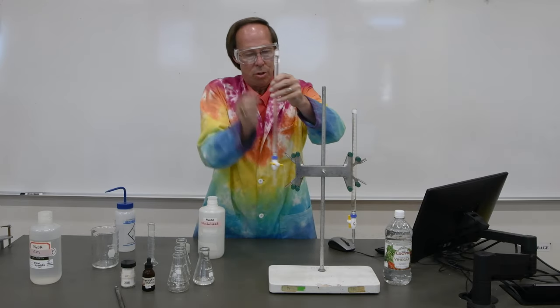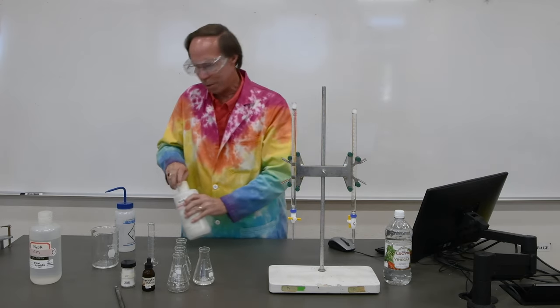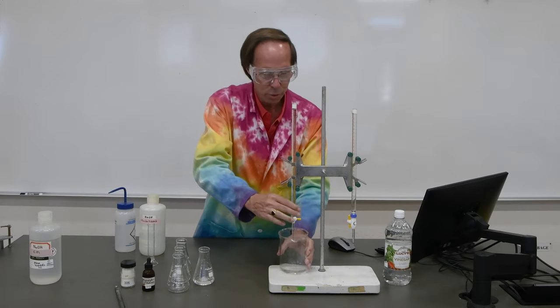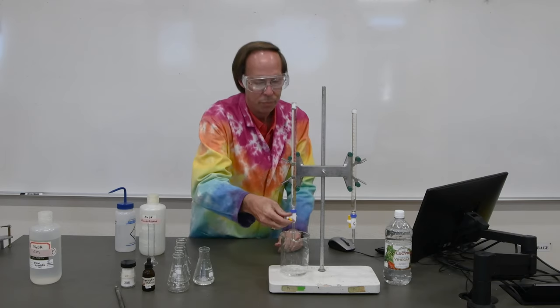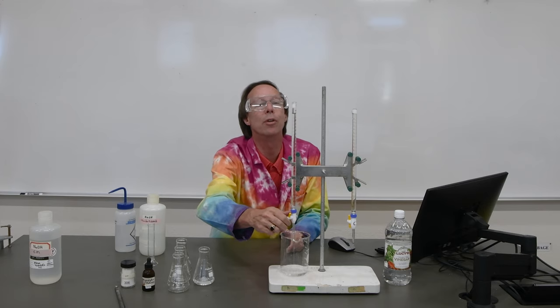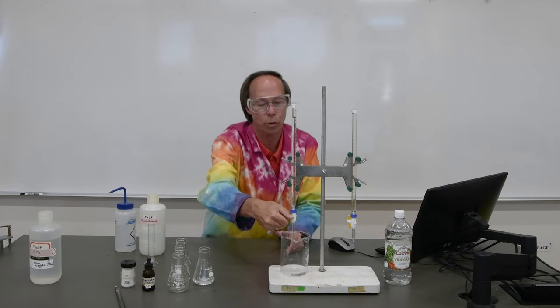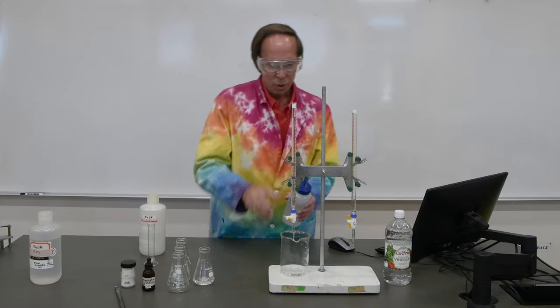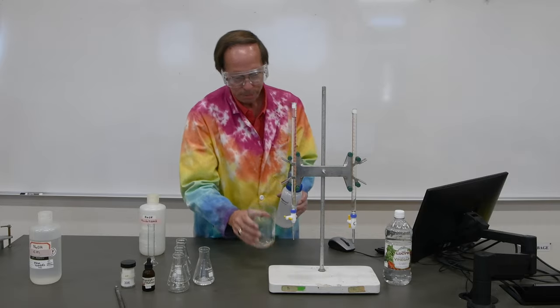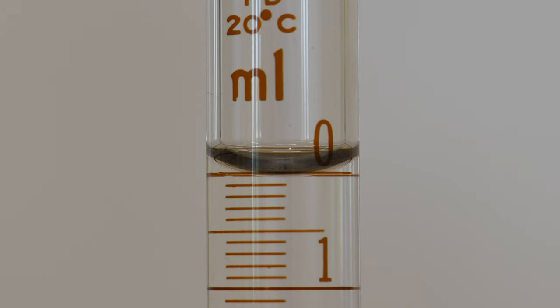All right. So we'll go ahead and drain this a little bit. I put it a bit above the zero mark, so we'll let some of this drain out and then we'll be ready to go. We'll go ahead and try to run that down as close to the zero mark as we can. Doesn't have to be on the zero exactly, of course. And that looks pretty good. Always a good idea. There's a drop of sodium hydroxide still on the tip. We'll just shoot that off, and now our burette is ready to go. Here's our initial burette reading. I've got it set just about exactly at zero, and we'll go ahead and set it at zero for each of the titrations.